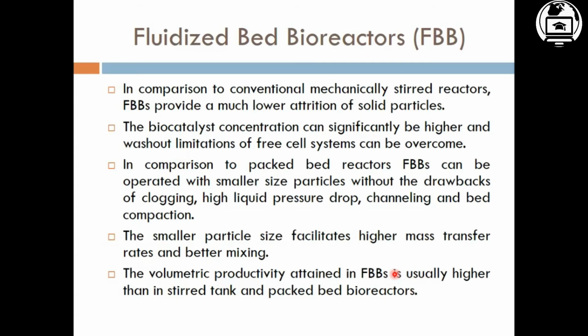In comparison to packed bed reactors, fluidized bed reactors can be operated with smaller size particles without the drawbacks of clogging, high liquid pressure drop, channeling, and bed compaction. These are all side effects of packed bed reactors. There may be clogging, there is a high liquid pressure drop, channeling may develop, and bed compaction is an issue in packed bed reactors, because there are layers of your material.